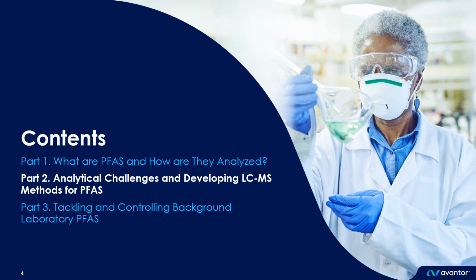So in part 1, we ran through some of the key background aspects of PFAS analysis, and today we're going to move on and take a closer look at how LC-MS provides a key solution for PFAS analysis. Primarily the discussion today is going to focus on analysis using triple quadrupole instruments, but many of the concepts I'm going to discuss are very much applicable to high-res approaches too.